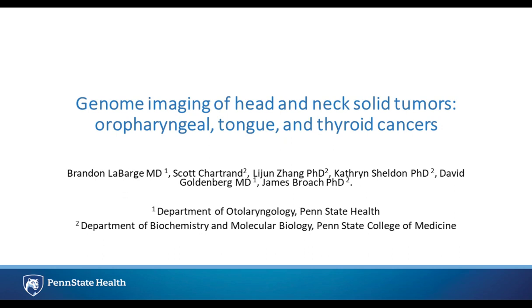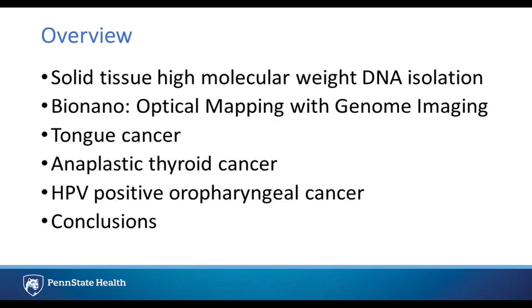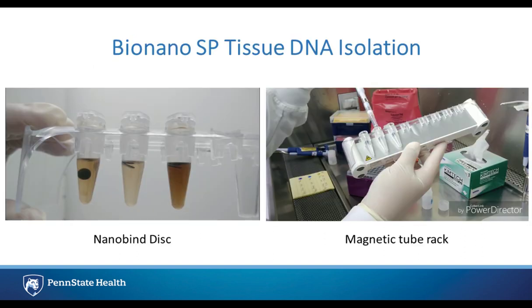Good morning, everyone. Thanks for the introduction there. Today I'll be presenting on a number of head and neck solid tumors using Bionano genome imaging. Beginning with an overview, I'll start with a discussion of the solid tissue high molecular weight DNA isolation protocol that Bionano has recently developed. I'll go over the Bionano platform in general, and then I'll move to a number of head and neck cancers, including tongue, anaplastic thyroid, and HPV-positive oropharyngeal cancer, and then wrap up with some conclusions.